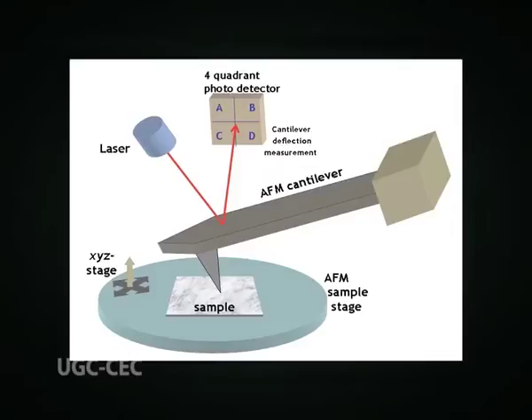However, as the cantilever is brought even closer to the surface such that the tip makes contact with it, increasingly repulsive force takes over and causes the cantilever to deflect away from the surface. A laser beam is used to detect cantilever deflections towards or away from the surface. By reflecting an incident beam off the flat top of the cantilever, any cantilever deflection will cause a slight change in the direction of the reflected beam.